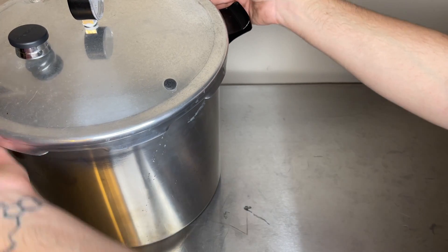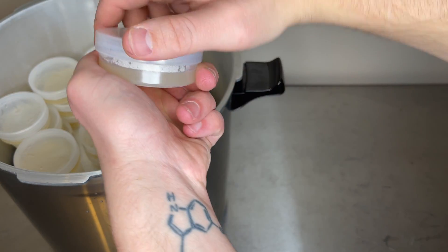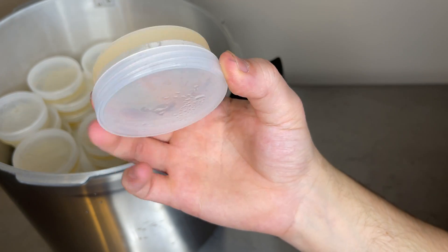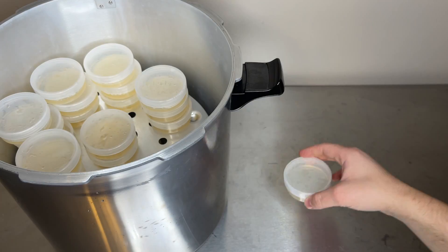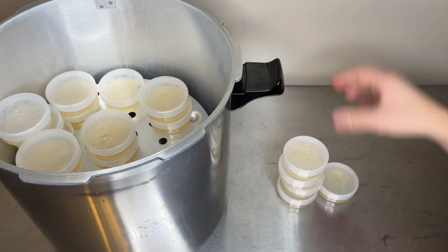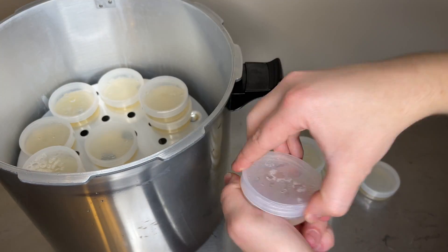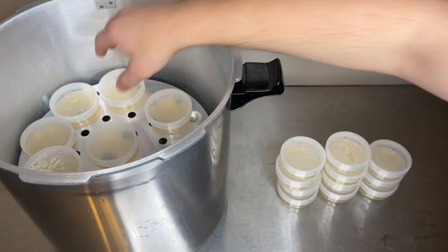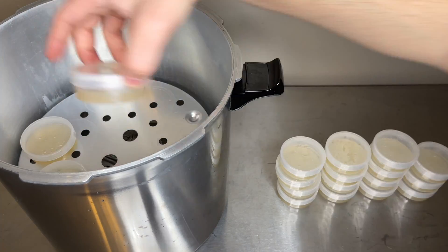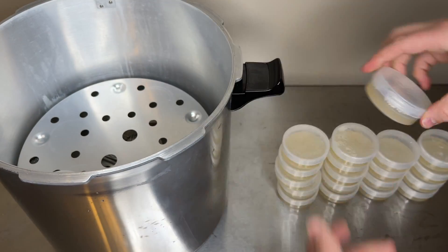After the pressure cooking cycle is finished, allow them to cool down naturally and then remove them from the cooker once they have cooled down, and then tighten the lids. I haven't had any condensation problems with these containers and the tops of them are pretty clear so that you can see the mycelium growing. I stored these agar containers around 75 degrees Fahrenheit for the first couple weeks just to make sure no contamination pops up before using them, and if there's any condensation in the top of the lid, usually keeping them around that temperature will make the condensation go away.